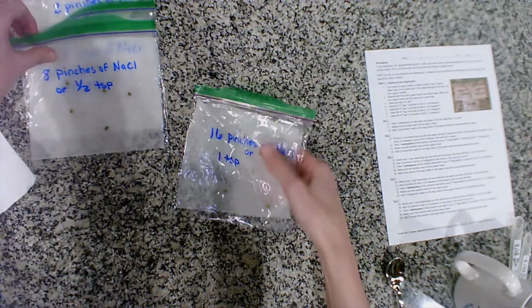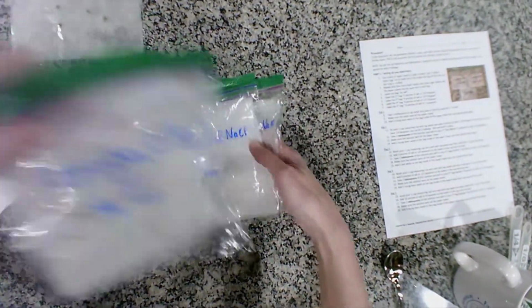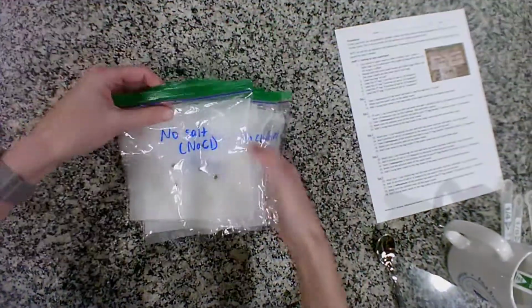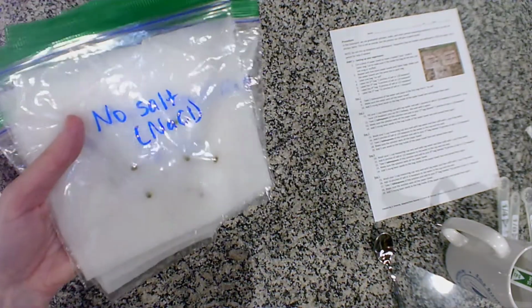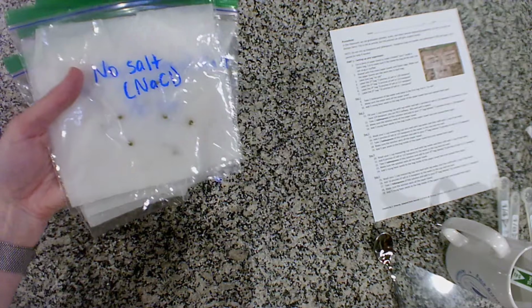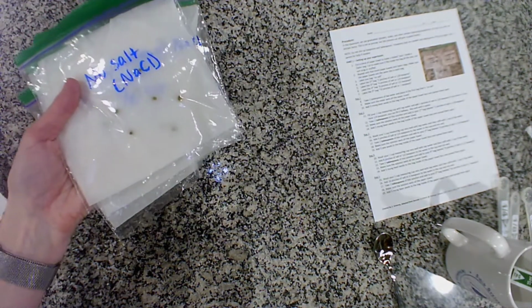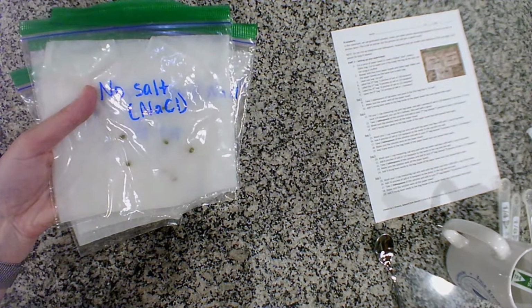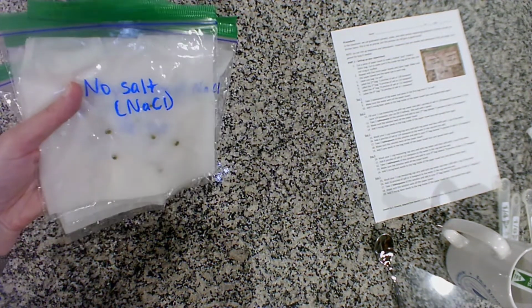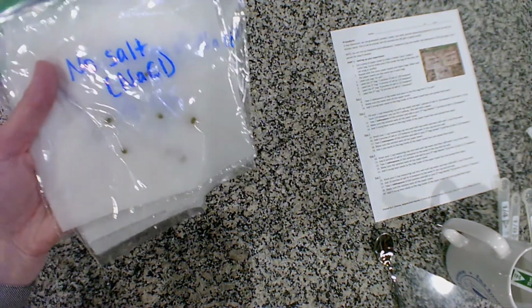Okay, so you should have your 5 bags. You want to put these in kind of a room temperature place. Dark is preferable, so maybe like in a drawer or a top cabinet somewhere where you're not going to see them. And then you want to come back in 4 days, take a look at them, and then we will look at the results. You'll definitely need to make sure you take pictures and do some measurements once you look at them. All right, that's it.